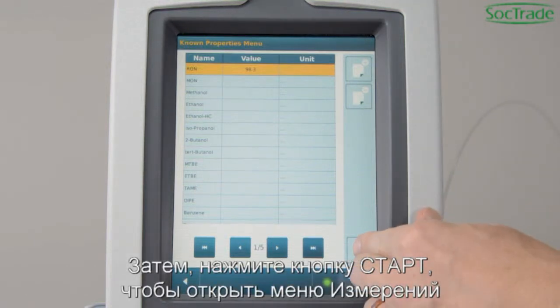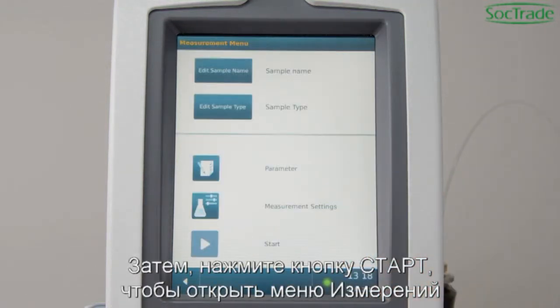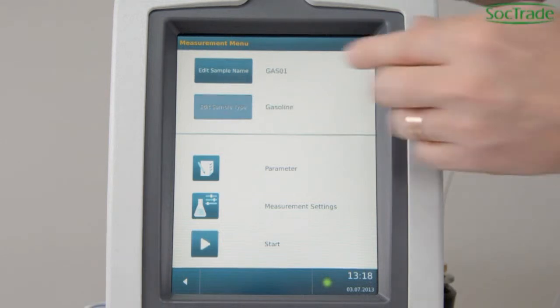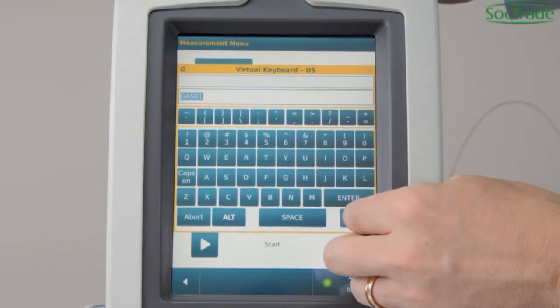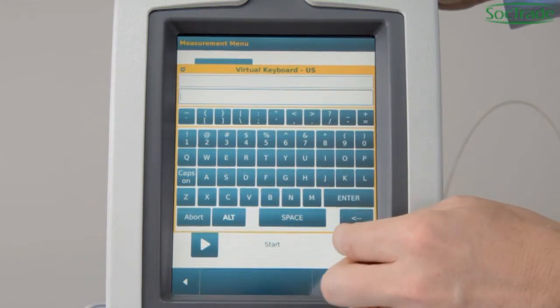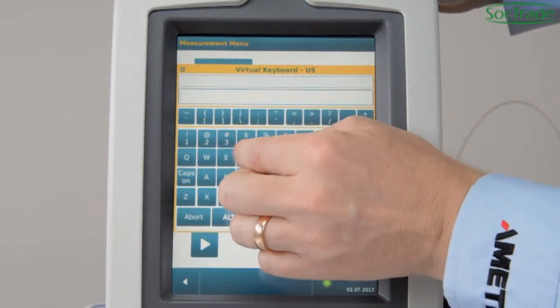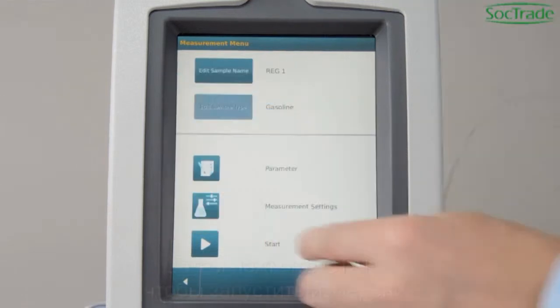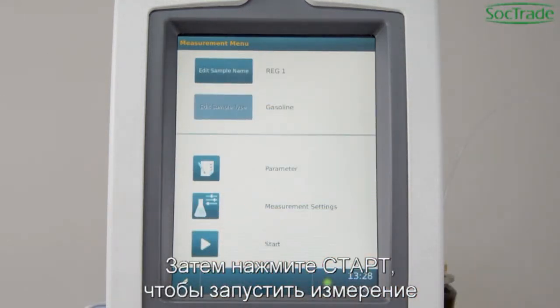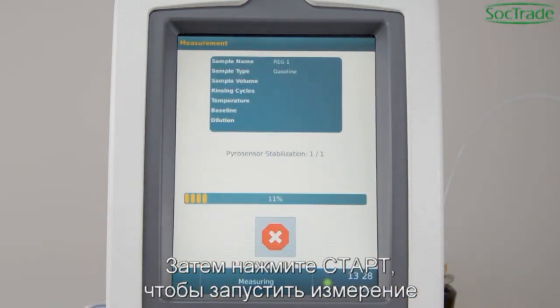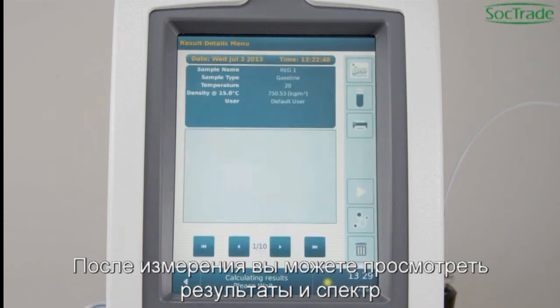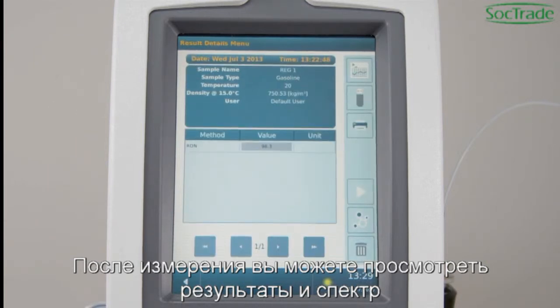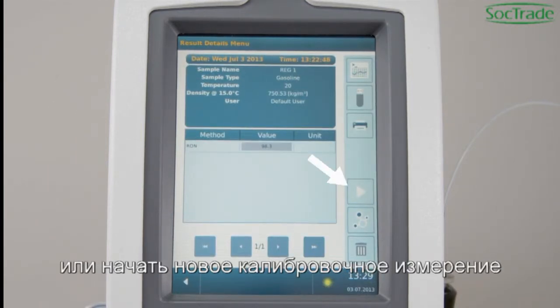Then press Start to open the measuring menu. Insert the sample name. Press Start to run the measurement. Once measured, you can review the result and the spectrum, or start a new calibration measurement.